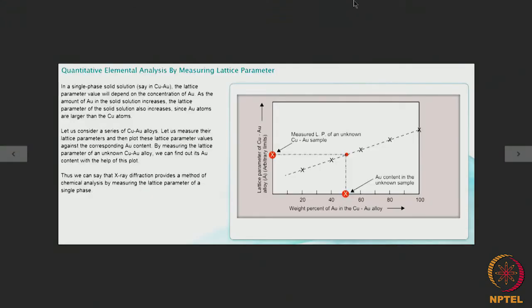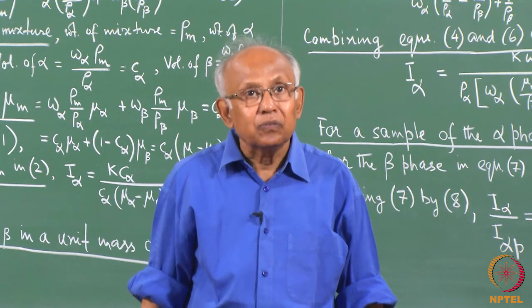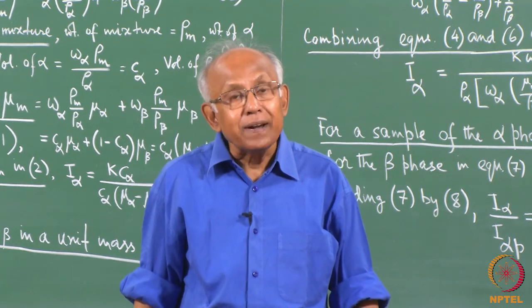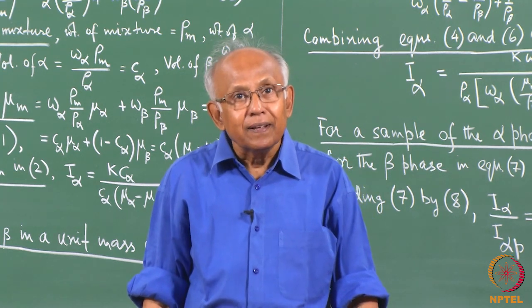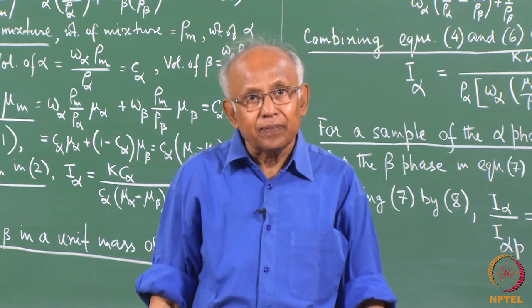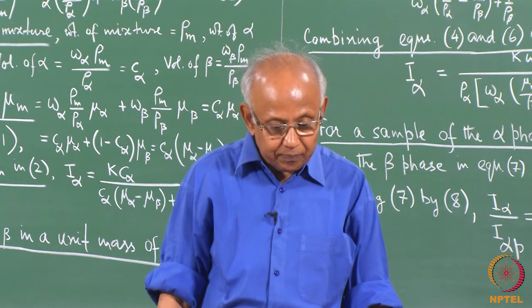Now, before going to the topic of quantitative phase analysis, I would like to say a few words about the quantitative elemental analysis that can be performed by the measurement of the lattice parameter of a phase or phases in a mixture.